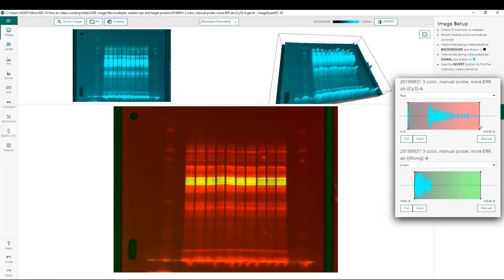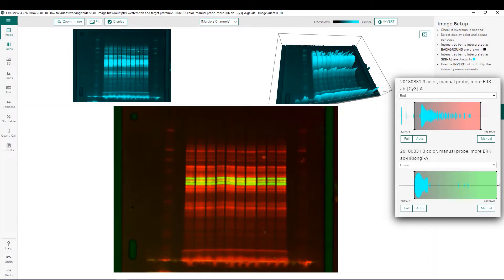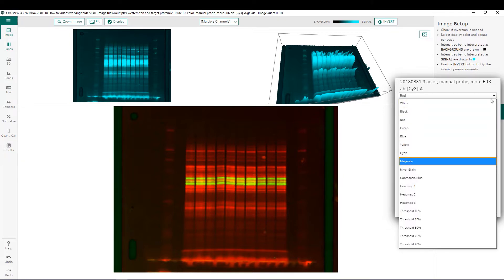We can see that we can adjust the contrast settings independently from each other. The red channel is our total protein load — we can pull up the background to reduce background signal and also decrease the upper signal. We can also adjust our green channel, which has our protein of interest, the same way, increasing it to get more visual resolution between bands. We can also choose to display each channel with different colors using the pull-down menus.